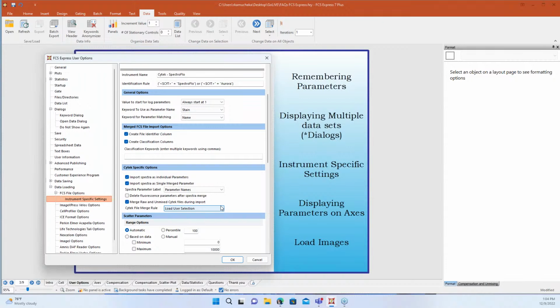Holly, how many times have you gotten this question? Over and over again. And I think it's important to point out that it says delete parameters, but it's not modifying your data files. So if you have that problem and you see that those parameters aren't there, it's just like Robin said, you can come in and uncheck that, reload the data, and then they will show up. So not to worry, we're not actually modifying your raw data, or your actual FCS files. This is an easy fix. It's just a matter of knowing where to go to fix it. Oh, I love that, because that is really important. We do not modify your raw data at all. We're simply telling the software not to display those parameters.